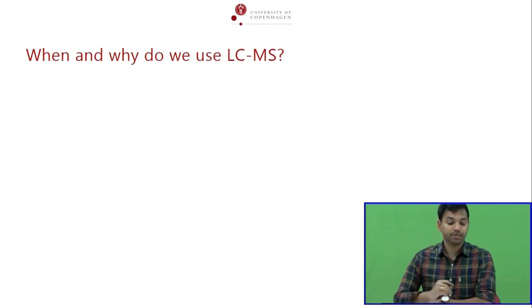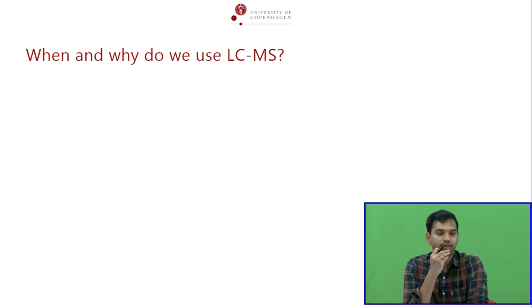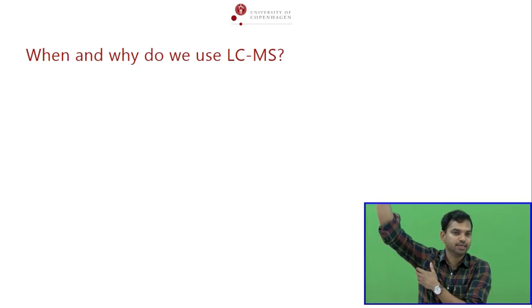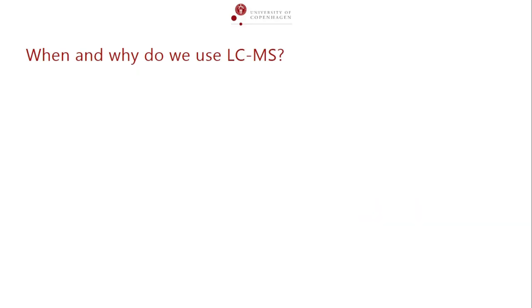I need to answer this particular question before going to that particular topic. When and why do we use an LCMS? Can you tell me? Have you ever used LCMS? Yes? Or you must have at least supplied the sample to somebody to run the LCMS, right? That's often what we do. Why did you supply the sample and why did you run the MS?